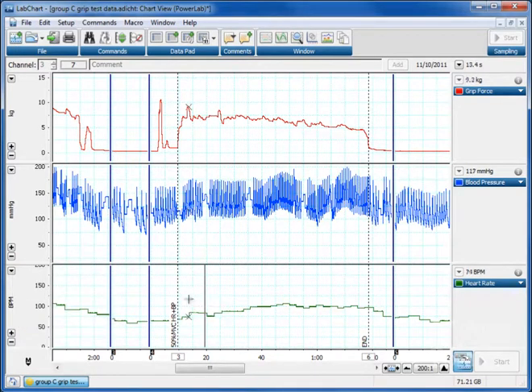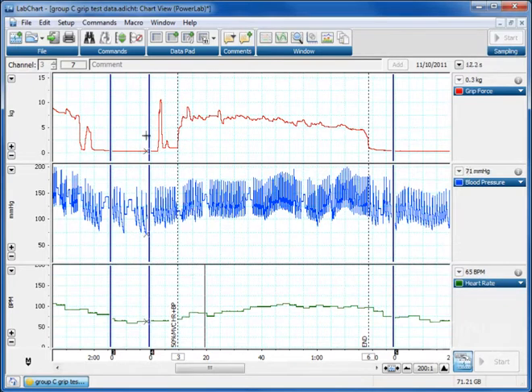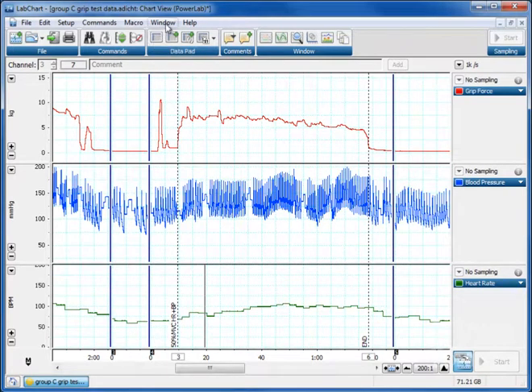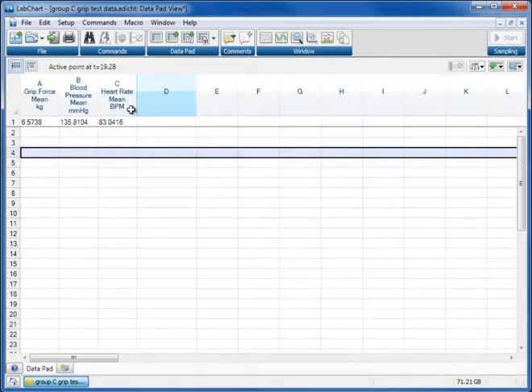So we're going to use another kind of mini window now, which isn't a DVM but it is just a little mini window that gives you a similar look but gives you much more interesting data. We access this new type of window using the data pad. You go to the windows menu and click on data pad and here's the data pad.